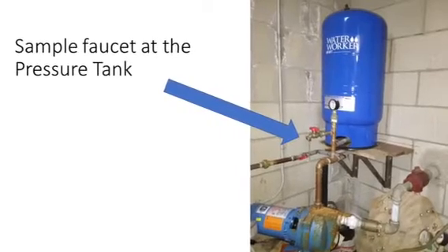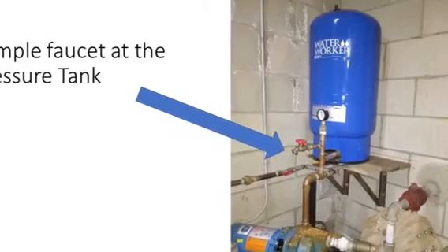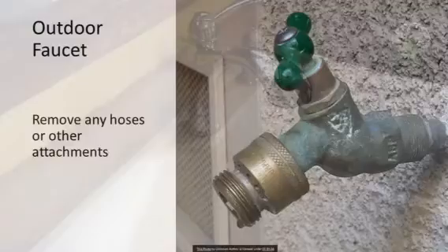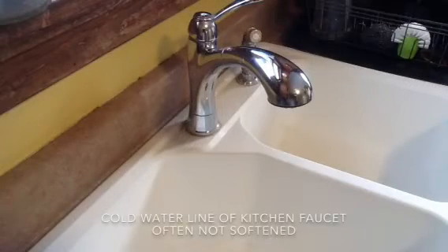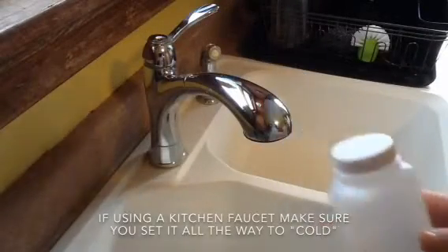Some suggested locations for the homeowner package include the sample faucet located near the pressure tank. The outside faucet could be another option. However, if you sample from this faucet, you should remove any hoses or other attachments and wipe the hose bib with rubbing alcohol to remove any dirt or debris prior to sampling. If you are unsure or have difficulty determining which faucets are untreated, we recommend using your cold water kitchen faucet. This is the one we'll use for our demonstration.